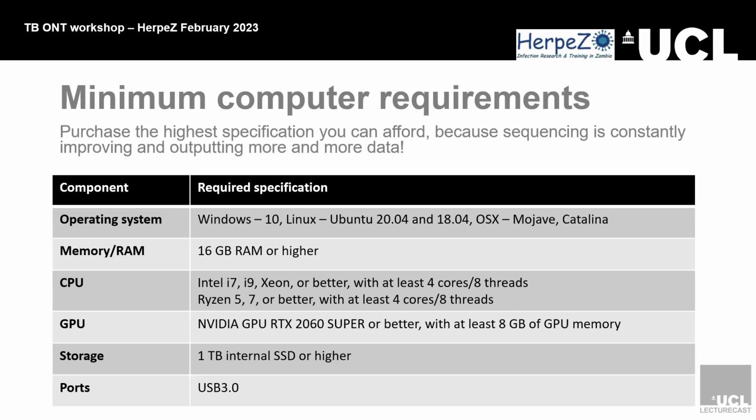Yeah. And also, as we were saying, you get so much data from these runs now that where you store it is a really important consideration. If you have hard drives, I've got about 4 or 5, 2 or 3 terabyte hard drives. I'm using them all up. So we at UCL have research storage drives, and I've got about 8, and they're all again 2 terabytes, and I'm using them all up really quickly to store this data.